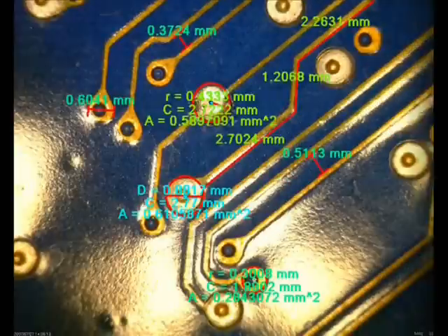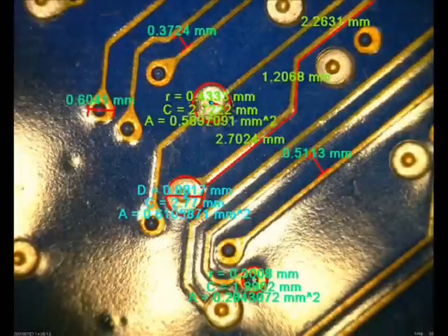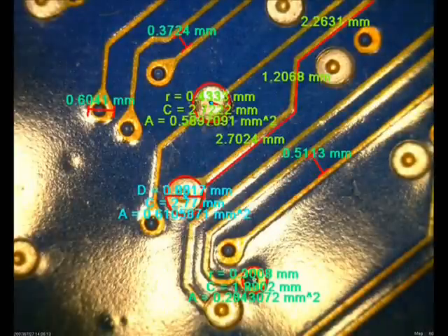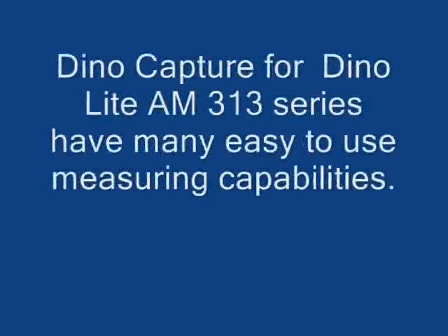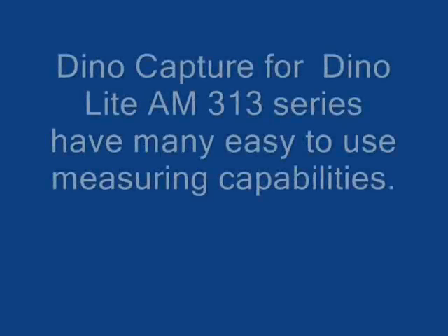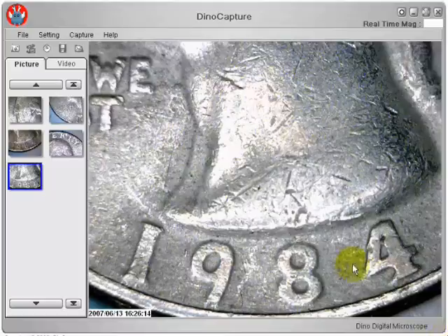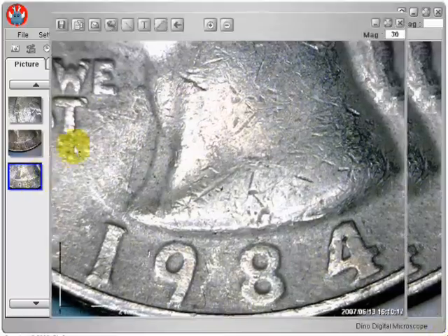I hope this tutorial gives you a better understanding on using the measurement functions with DinoCapture. DinoCapture for DinoLight AM313 series have many easy to use measuring capabilities.